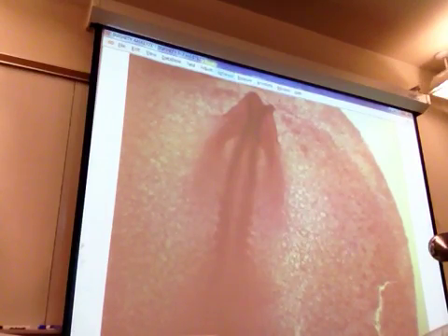So what's all this stuff that's staining then, since we oriented ourselves? Yolk. It's yolk. So this is yolk sac. All of this stuff that's all dark is yolk sac out here, and the animal's sitting on top of it.